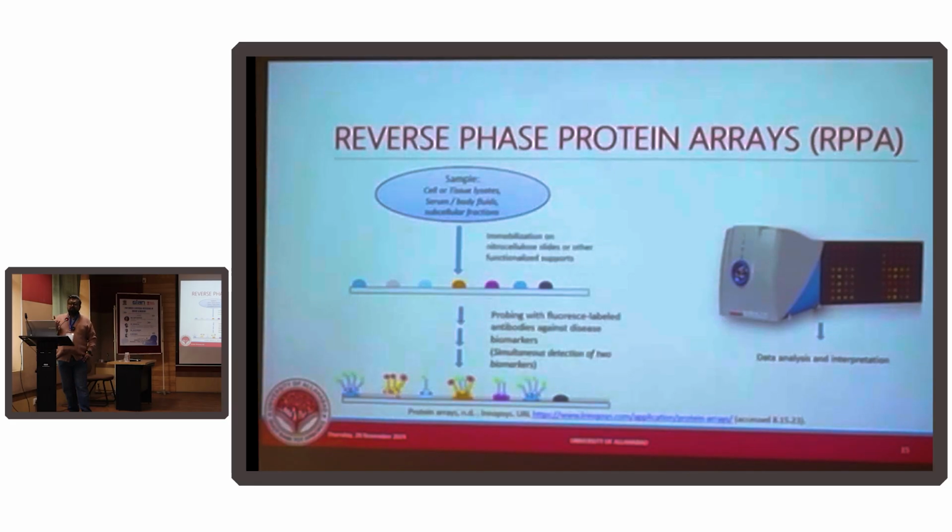But again, if you do the work in collaboration with a lab that already has a scanner, it brings the cost down. And in India, I think there are almost 5 or 6 scanners that I personally know. One is with Professor Sanjeeva, another is I think at NII Delhi. One is at THSTI, Faridabad. I'm not very sure if they're still working. But you have one Agilent instrument in BHU itself. So you can do that. You have to plan your work. You can do your incubations, and you can just scan them.